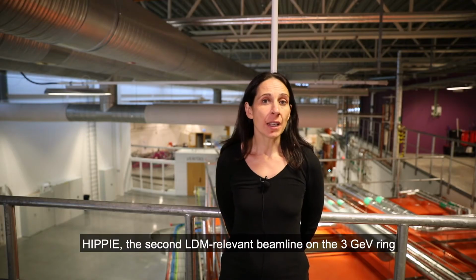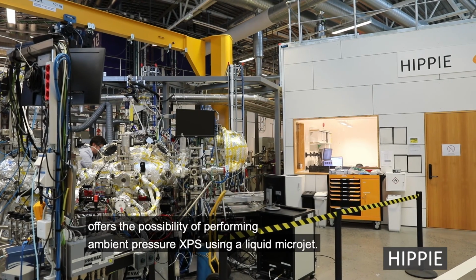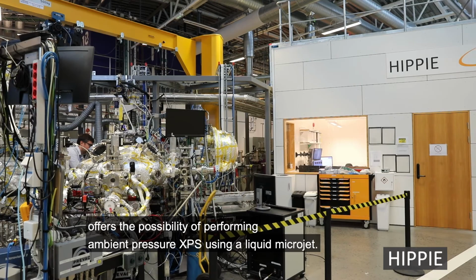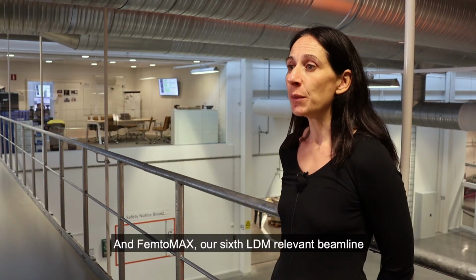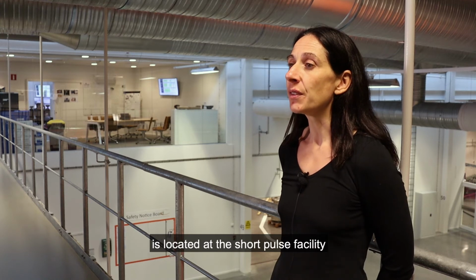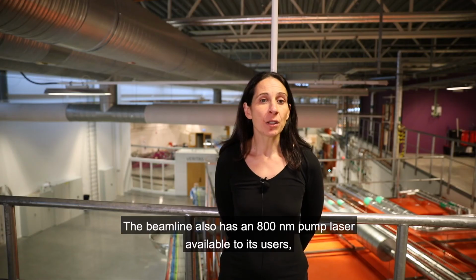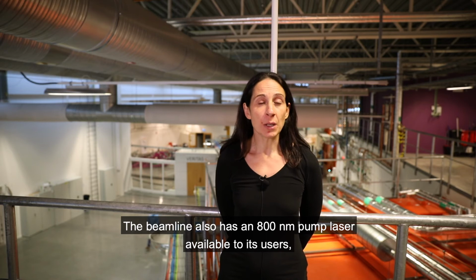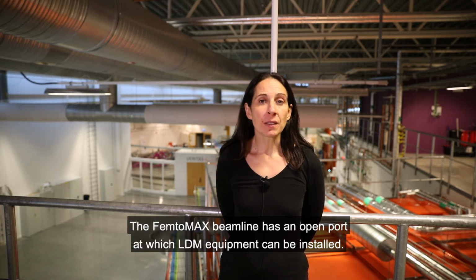HIPPIE, the second LDM relevant beamline on the 3 GeV ring, offers the possibility of performing ambient pressure XPS using a liquid microjet. And FemtoMAX, our 6th LDM relevant beamline, is located at the Short Pulse facility and delivers photon pulses of 100 femtoseconds duration. The beamline also has an 800 nanometer pump laser available to its users, thereby facilitating pump probe measurements. The FemtoMAX beamline has an open port at which LDM equipment can be installed.